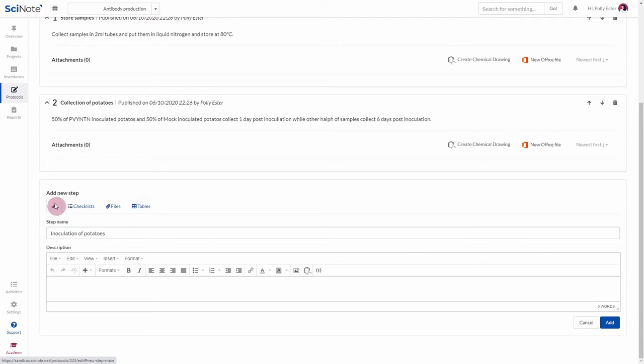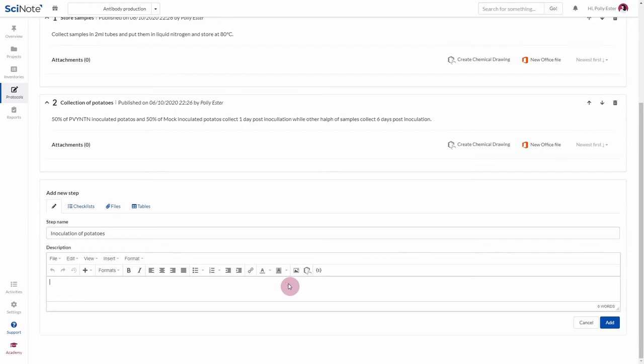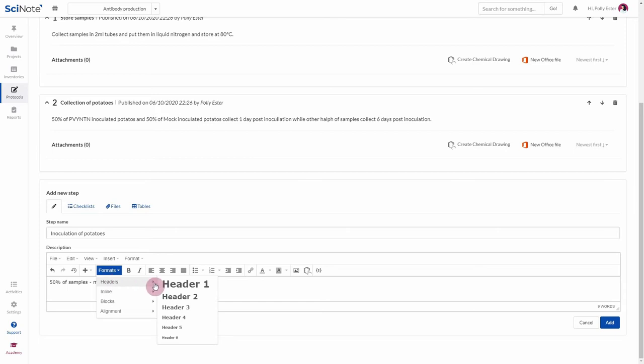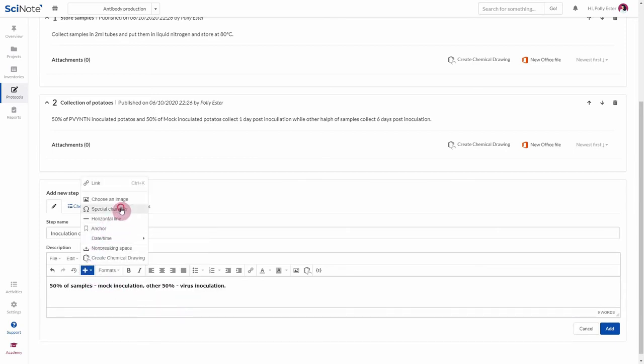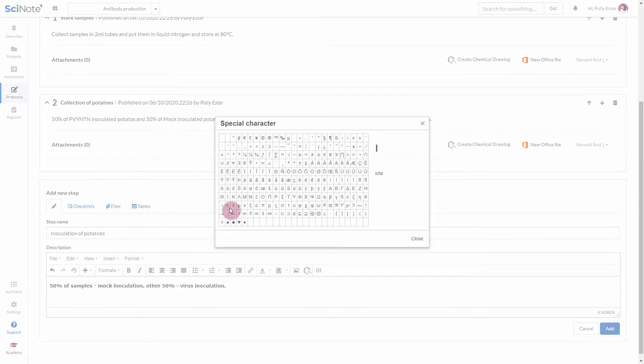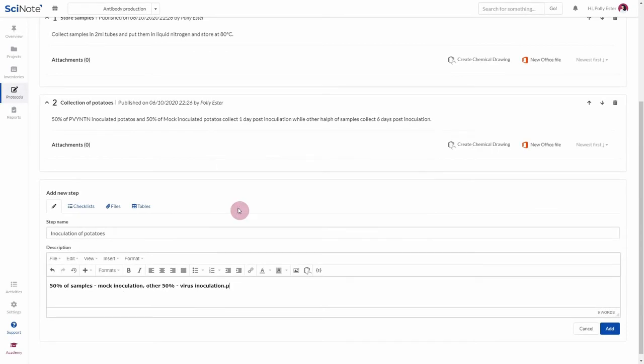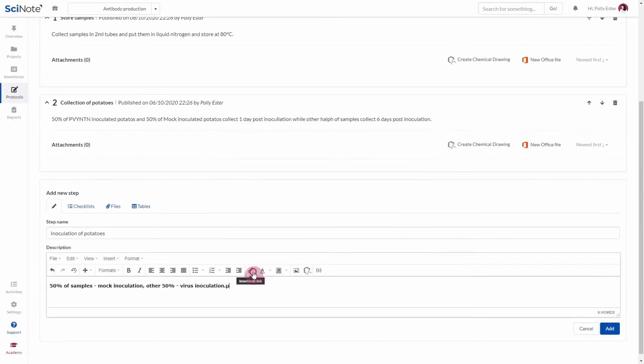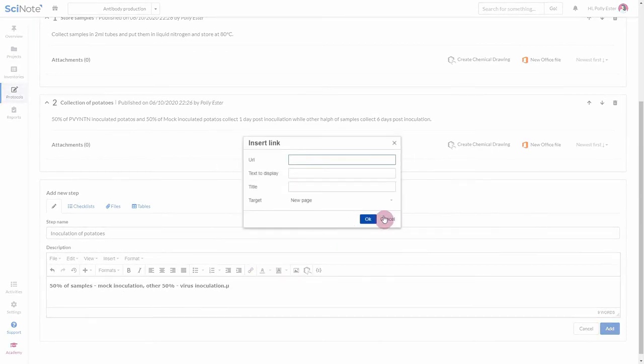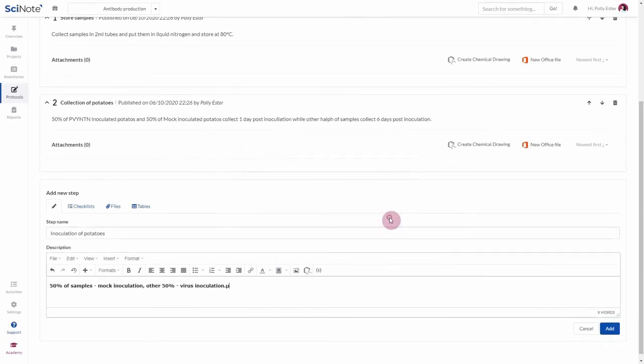This is a rich text field, meaning you have plenty of options to format your text. For example, if you want to change the size of your font, click Formats and then Headers. If you'd like to add a special character, click here and then select Special Character. You can also embed a picture to your step or add hyperlinks to your image or other large files.